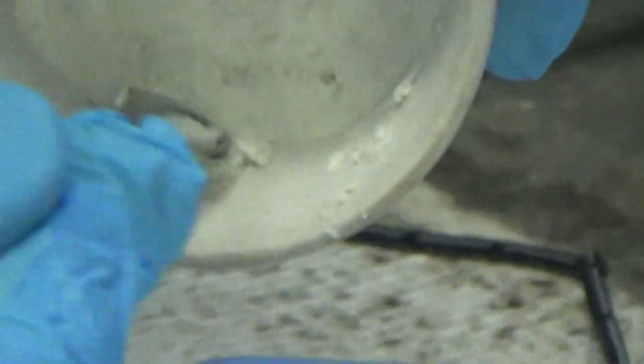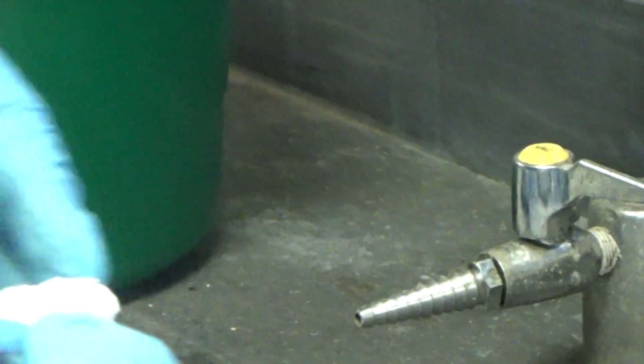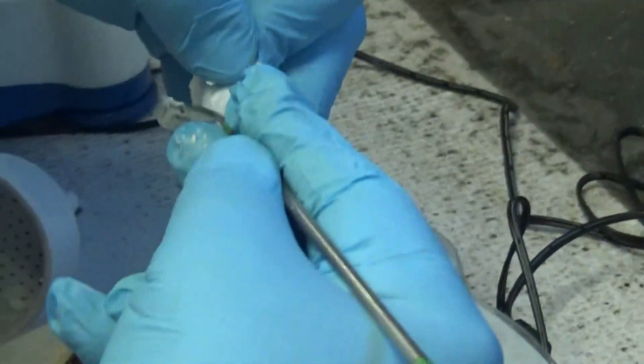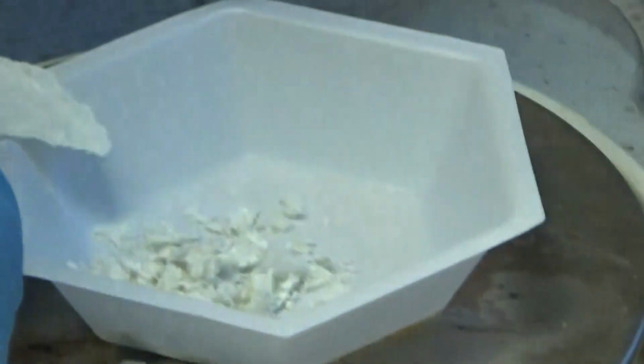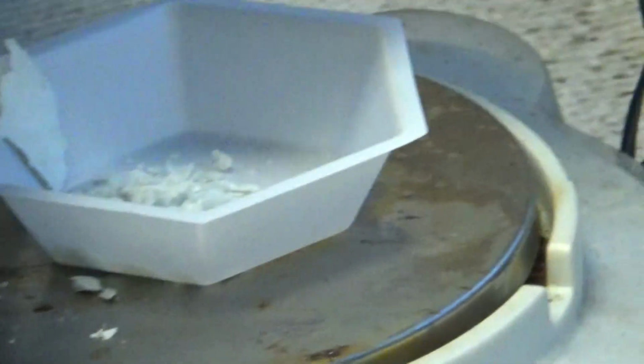Well behaved, white solid. Scrape off the... Get a nice good yield, hopefully. Crude yield, because there's quite a lot of water in there still. Uh-oh, a little bit came out on the balance. That's okay, that's fine.